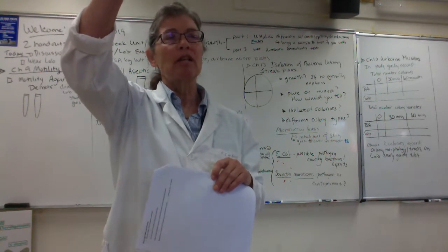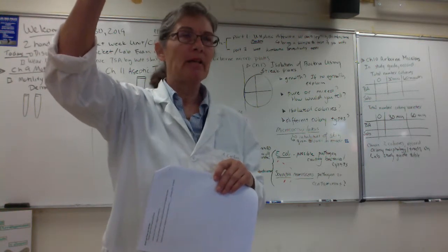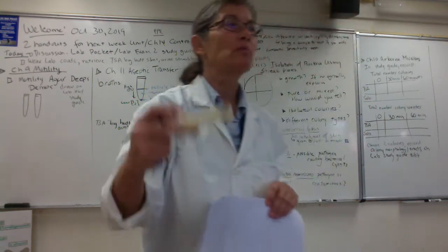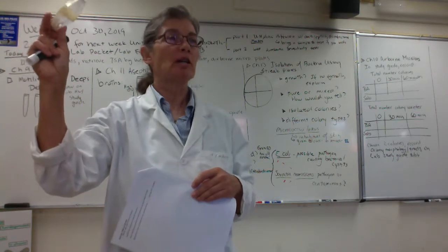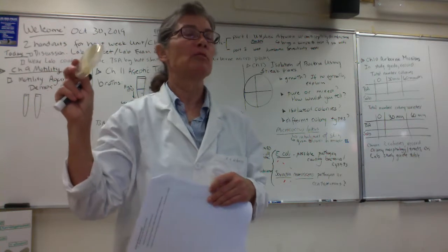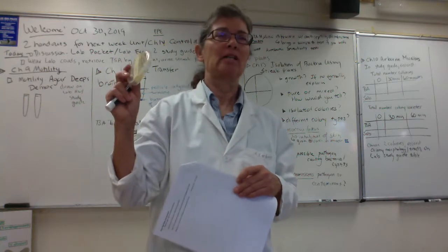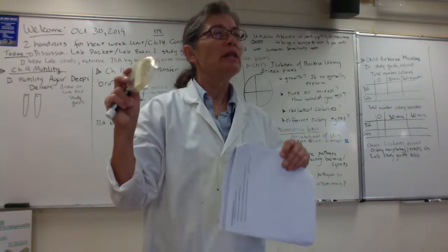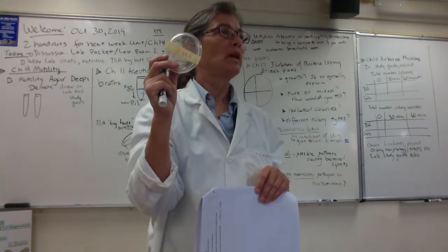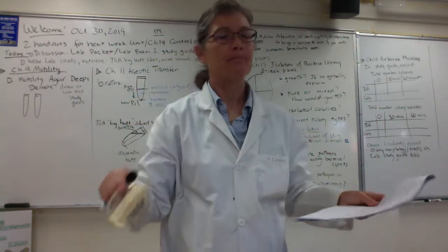The only problem is, sometimes different bacteria will appear the same in a gram stain, right? Another possibility is you could take a loop full of broth and streak it on a streak plate and see if you get different kinds of colonies forming, because our hypothesis is different microbes will form different types of colonies. And again, there's always a drawback. Sometimes different bacteria will form similar colonies. But at least initially, gram staining or streaking an agar plate would be 2 ways to help you determine if your culture was still pure or if it had become contaminated.